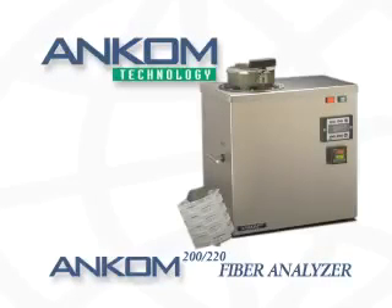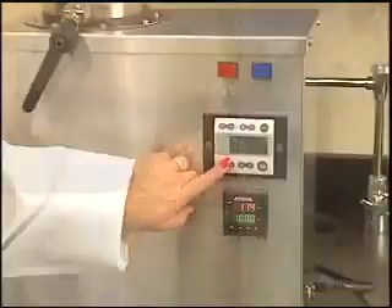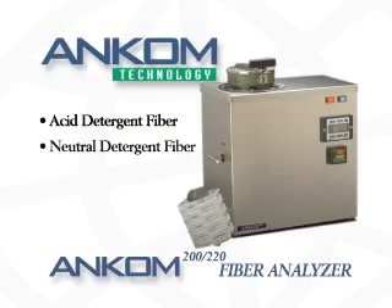Introducing the ANCOM Fiber Analyzer, offering both high efficiency and economy to your lab's fiber analysis operations. The ANCOM Fiber Analyzer provides for the precise and accurate determination of acid detergent, neutral detergent, and crude fiber in feeds and forages.